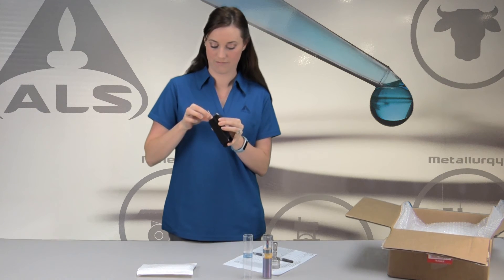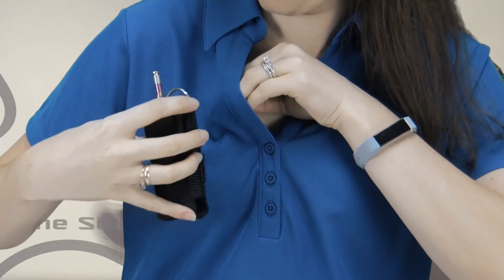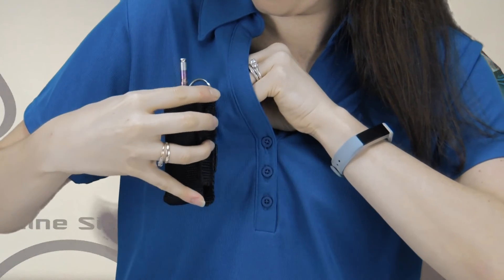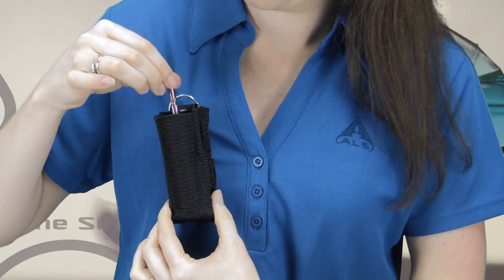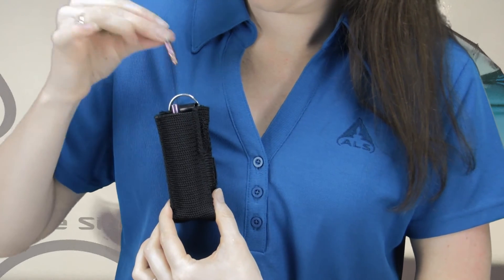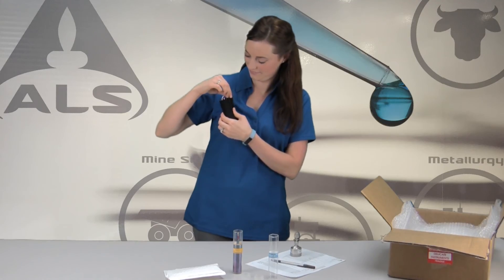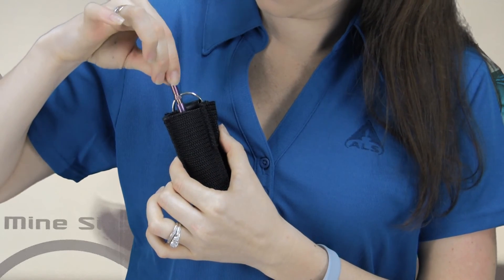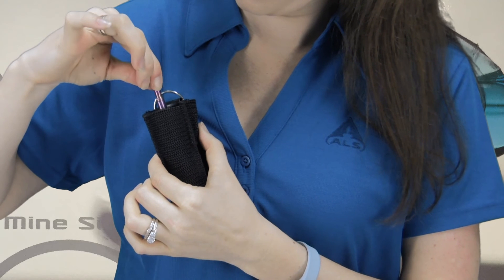To begin sampling, place the HDS personal monitor in an ALS-provided lanyard near your breathing zone and twist off the removable top of the microvalve. Save the cap in the side pocket of the lanyard or in the original shipping container for later use. Once the sampling event has ended, stop the sampling process by simply replacing the removable top of the microvalve.